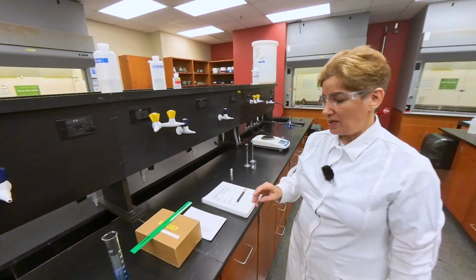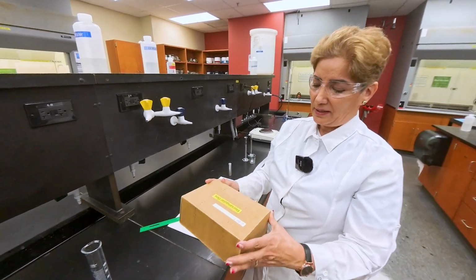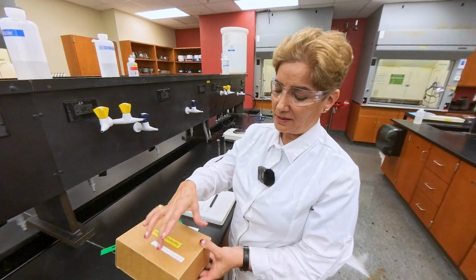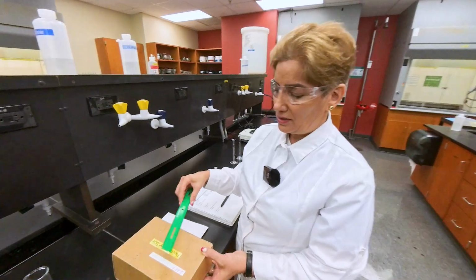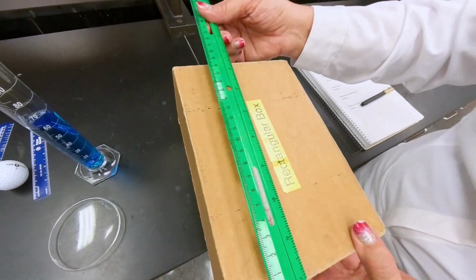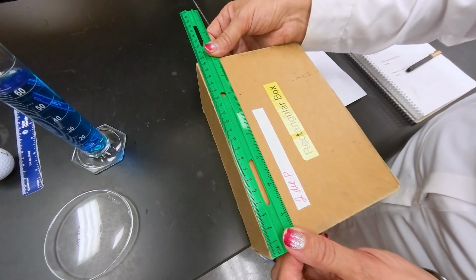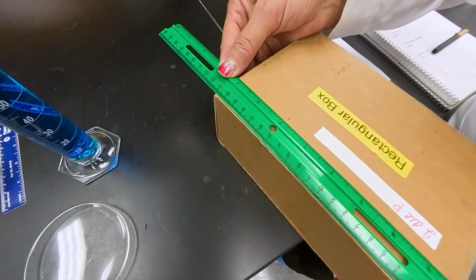Next, we are going to measure the volume of this box. It's a perfect rectangular shape box, so I can just measure the dimensions, the length, the width, and the height, and again use the formula given in the lab manual to calculate the volume. For this one, I'm using a ruler. I go from the edge, and just to make sure that the ruler is aligned straight, I'm using it from one corner to the other corner.